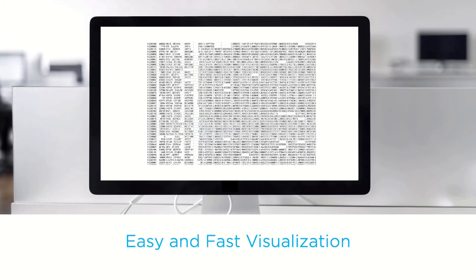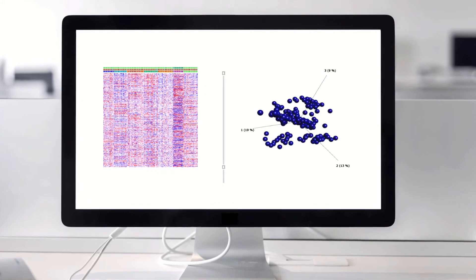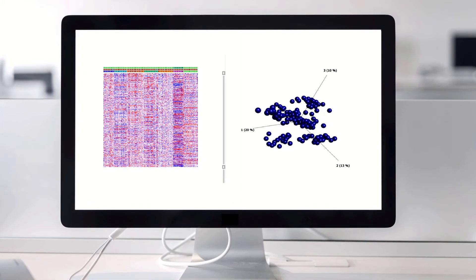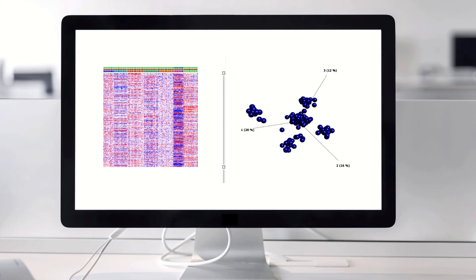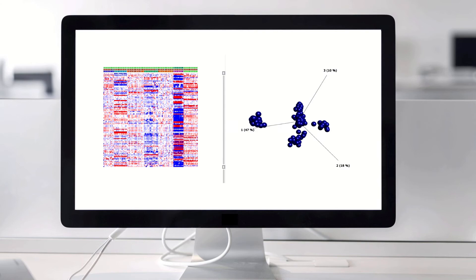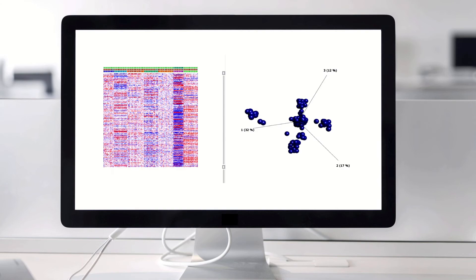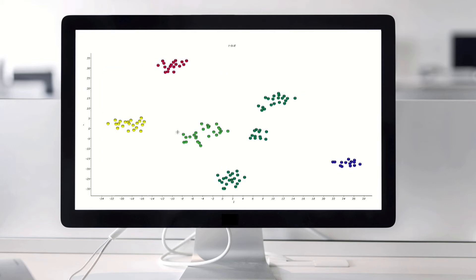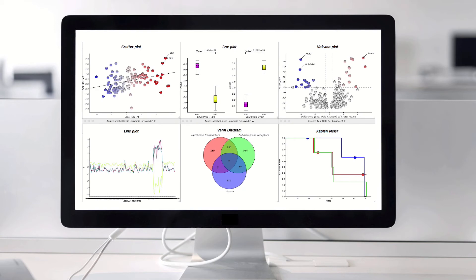Easy and fast visualization are central and key components in this program and make it possible to easily explore groups and patterns in big datasets. Plots such as heat maps, PCA, t-SNE, and many more are easily configured and allow the user to quickly obtain an understanding of data.